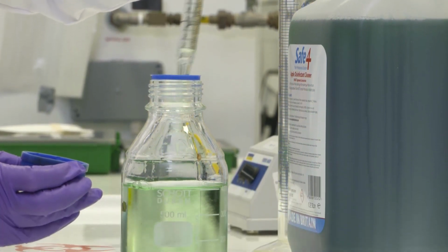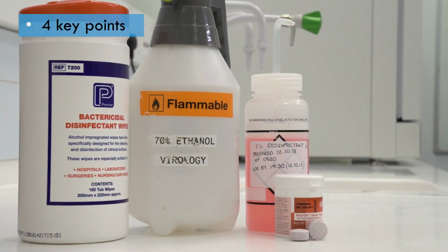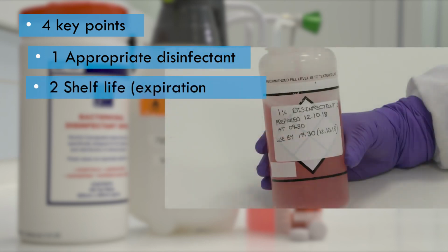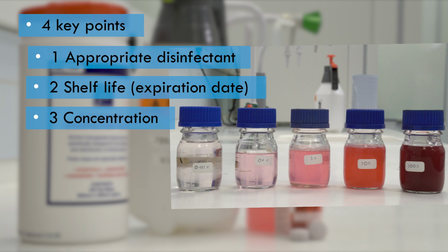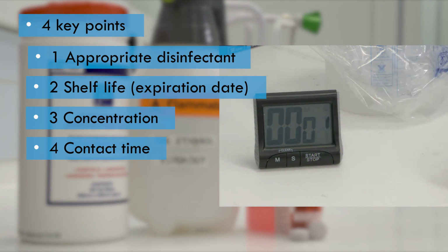Every time you use disinfectants, it's very important that you are confident that you are meeting the following 4 criteria. You are using an appropriate disinfectant. This must be effective against the biological agents you are handling and safe to use on the surfaces you are decontaminating. The disinfectant is within its shelf life, also known as its expiry date. It is being used at the correct concentration. And it's in contact with the contaminated surface for the right amount of time to inactivate any biological agents present.